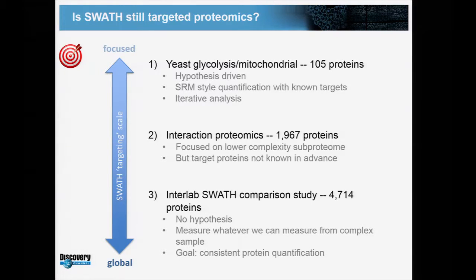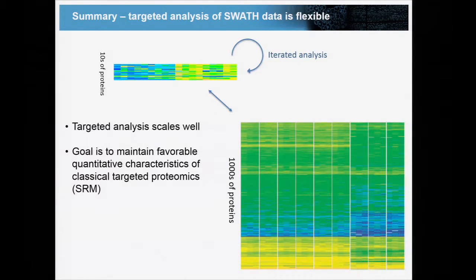I don't really care. The point I'm trying to make is that we still apply this targeted data analysis paradigm, and this is what leads you to these matrices that have very complete values. This is what Bruno showed before, what Jared showed before: by having this fixed duty cycle and this targeted data analysis, we can get to very complete data matrices.